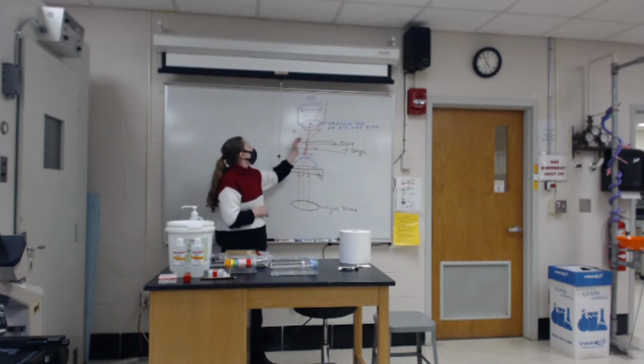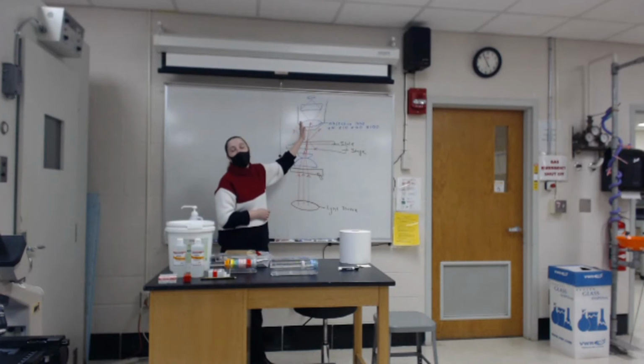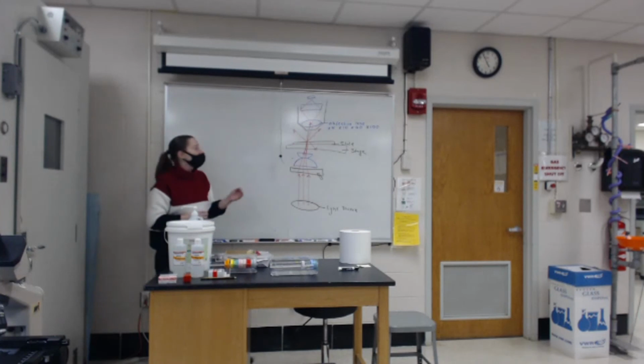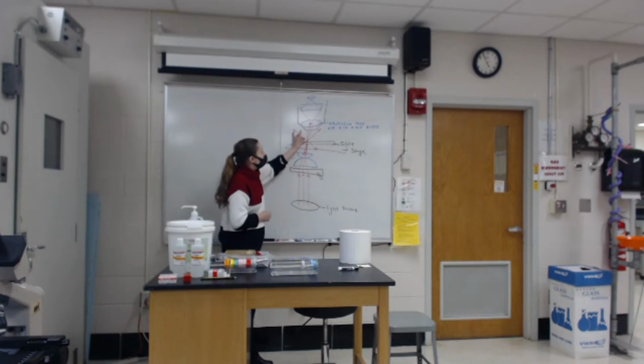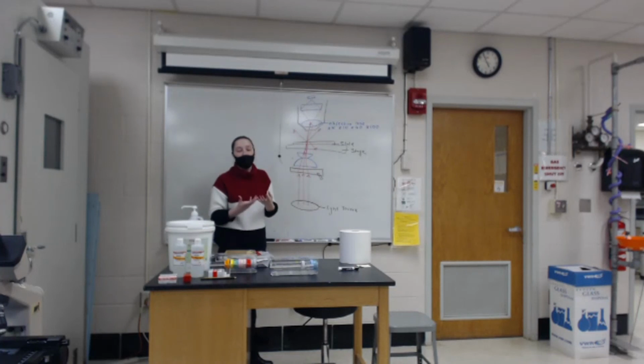So normally, with 4, 10, and 40x, it's okay for there to be this difference between slide glass and air, because the working distance is far enough away that it will catch a bit of the light, and so we'll still be able to see our sample. However, if we get to 100x, the working distance is so small that so much of the light passes away from the lens itself. So we're not collecting enough light, and that's going to affect our resolution.